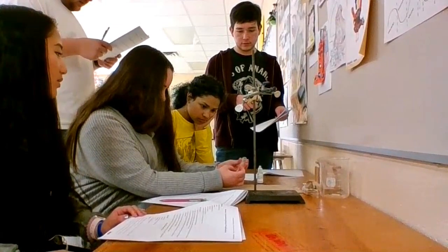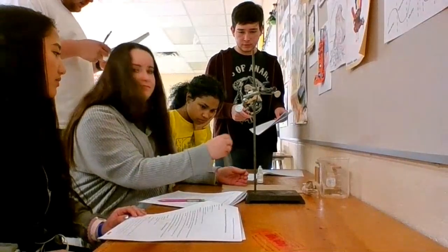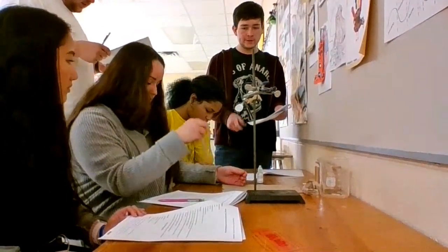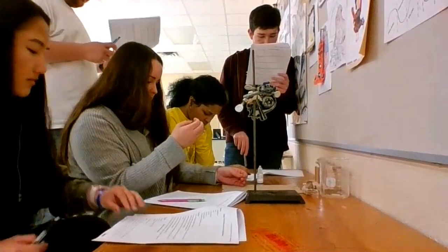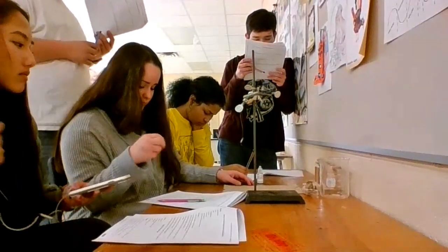Just kind of swirl it around, yeah, just coat the whole inside. Let me drop some in. I love this stuff. I want to do it. No, you're gonna crush it.